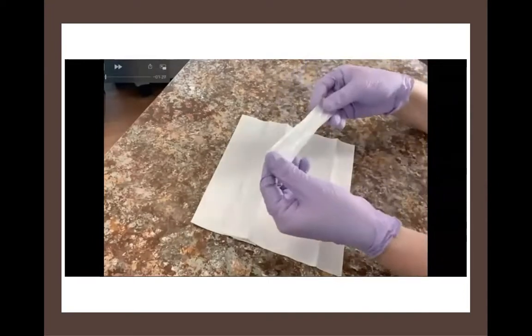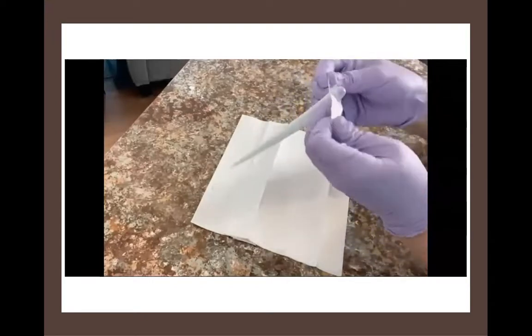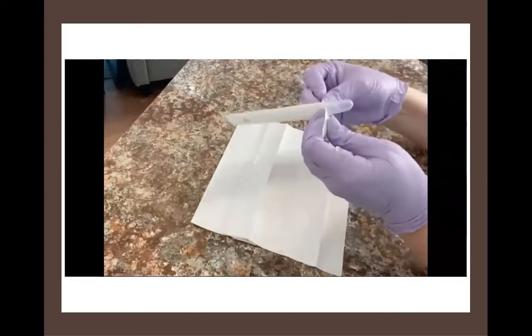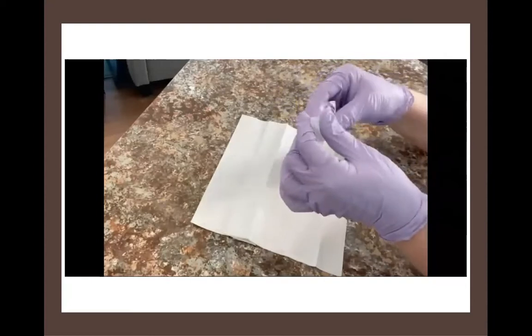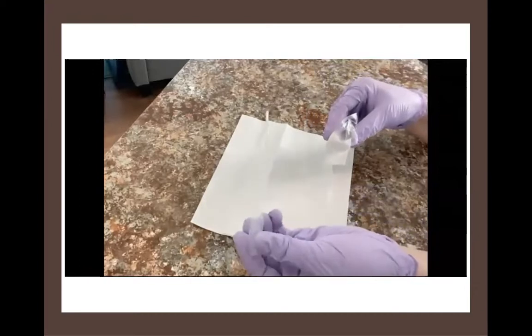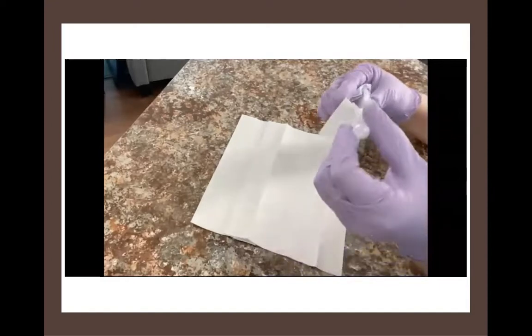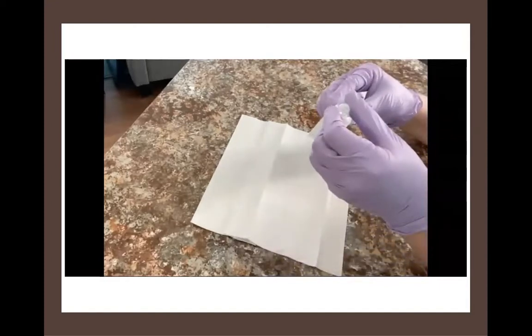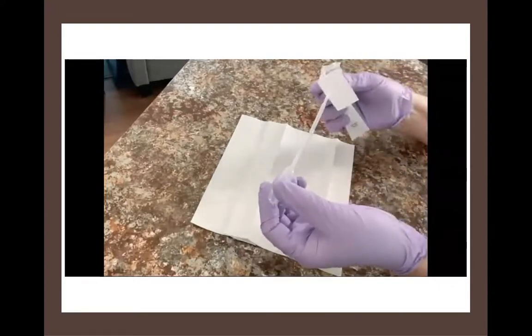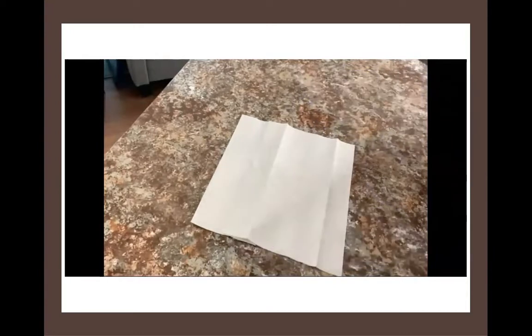Remember, transfer pipettes also come in these single-use sterile packages. When you open these up, you're going to first see the bulb end. And again, you want to open these carefully and pull them out carefully. But now the end that will touch your liquid broth is sterile. You can pull up a larger volume with these than you could with an inoculating loop, which makes them very nice. Very inexpensive, very widely available, very widely used, these transfer pipettes.